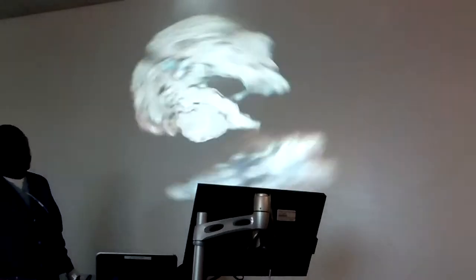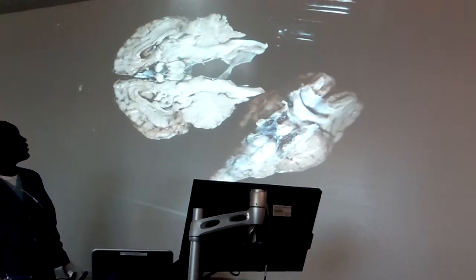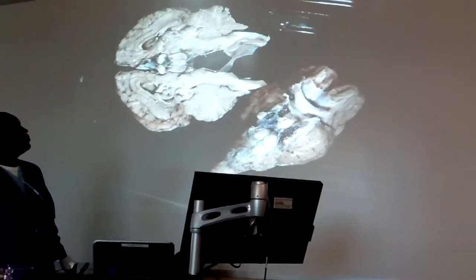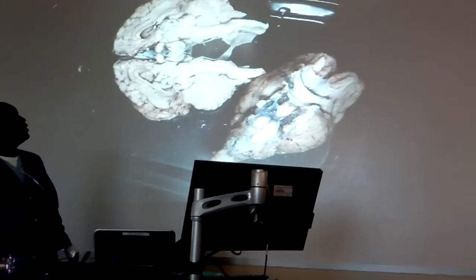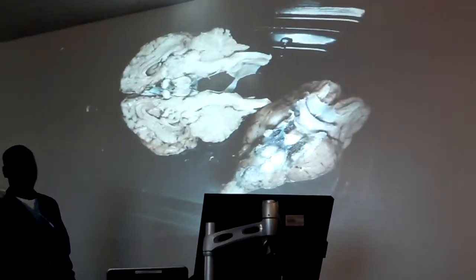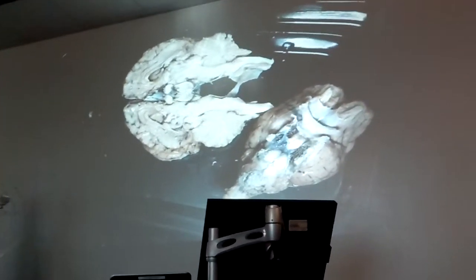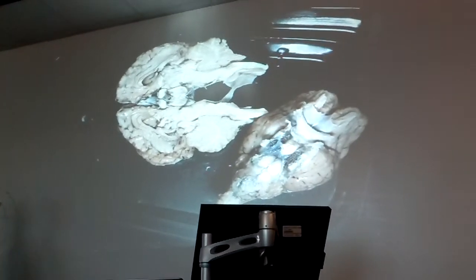So what we do is do it like this. That's even better. How did it look on the video? Looks good. All right, so here's what we got. Same thing we just did, except we're doing it from a sheep brain perspective.